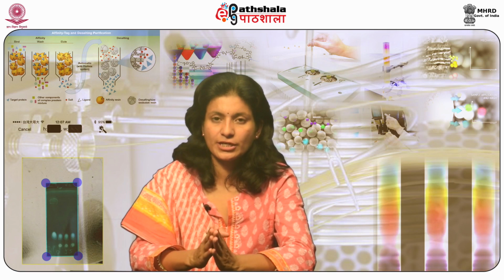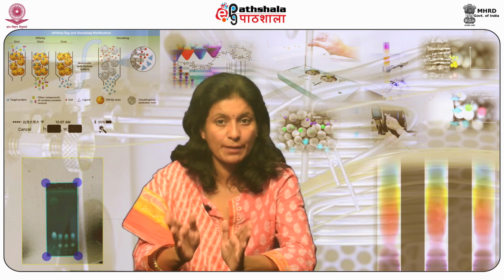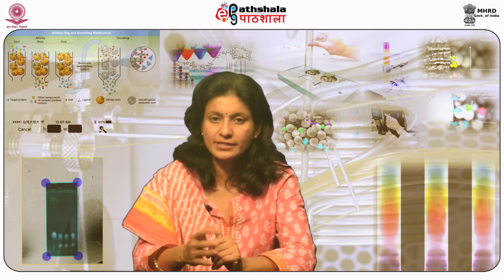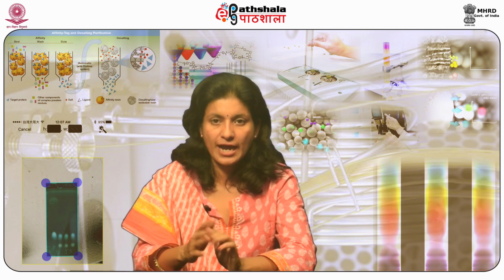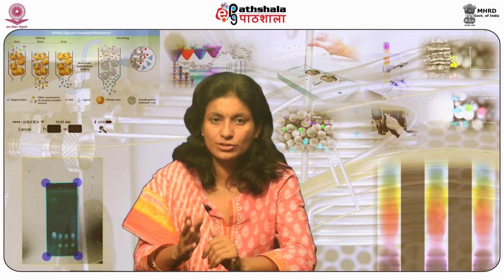Advantages of ion exchange chromatography. This approach has been utilized for the evaluation of anions and cations, implicating metal ions, hydroxyl compounds, peptides, organic acids, nucleotides, and alcohols, etc. It has been successfully applied to the investigation of deteriorated products, raw materials, impurities, bulk active ingredients, etc. at various stages of production steps, in addition to the evaluation of the cleaning solutions of production apparatus, waste streams, container compatibility, including other utilizations.